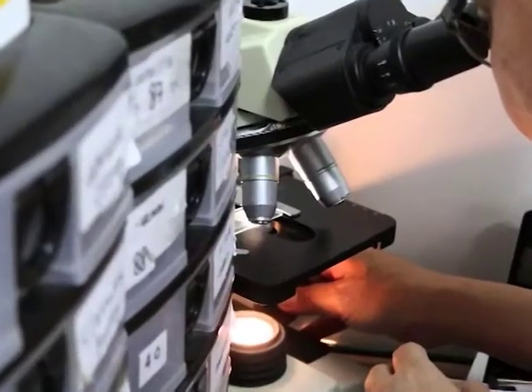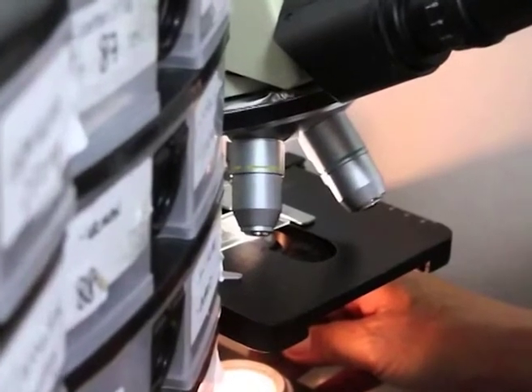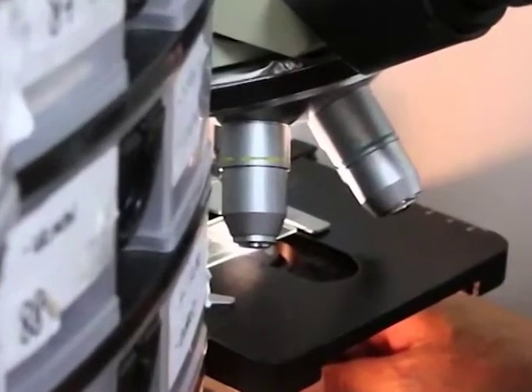Bigger chips are separated from the sample and any possible physical matching of the broken edges of the chip in the exhibit and the control sample is then done. Physical match is the most conclusive type of examination that a forensic investigator can perform on paint samples. It involves the comparison of edges and surface striae between samples. Both the edges and the striae in question must possess unique characteristics.